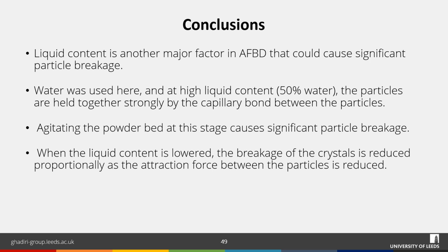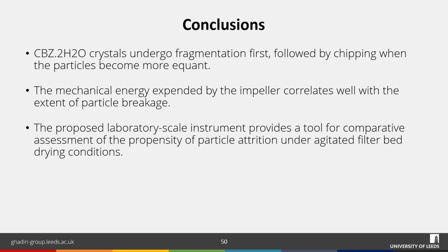Water was used in this work, and at high liquid content, 50% water, the particles are held together strongly by the capillary bond between the particles, and agitating the powder bed at this stage could actually cause significant particle breakage. And when the liquid content is lowered, the breakage of the crystals is reduced proportionally as the attraction force between the particles is reduced. Carbamazepine dihydrate crystals undergo fragmentation first, followed by chipping when the particles become more equant.